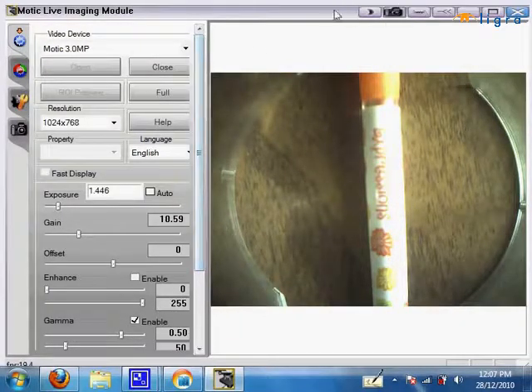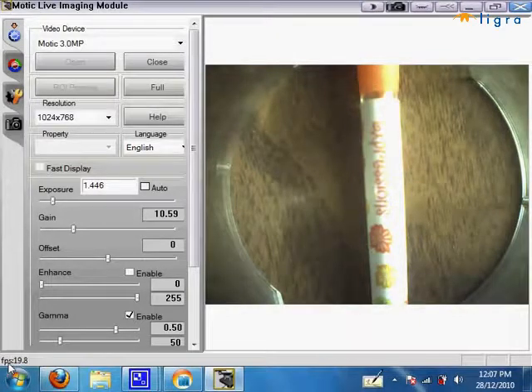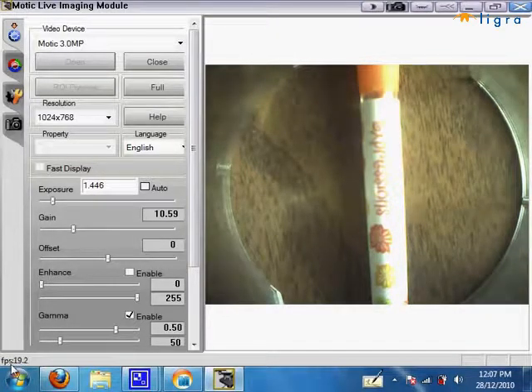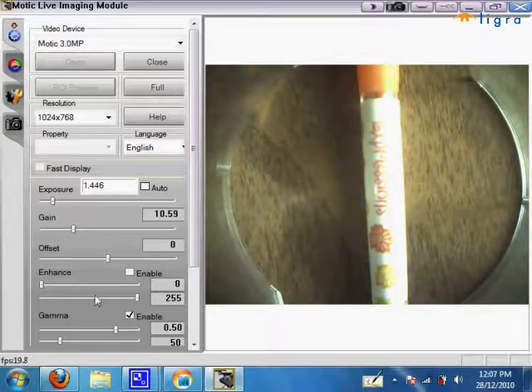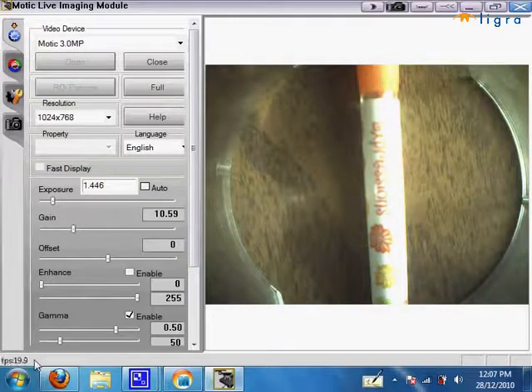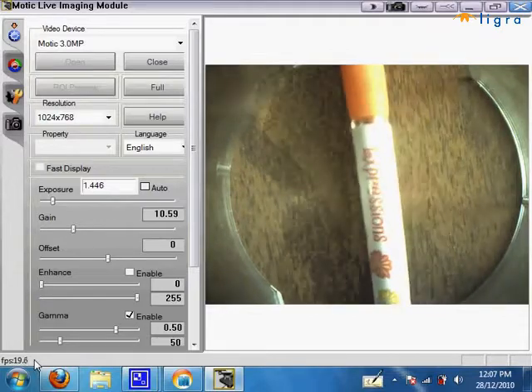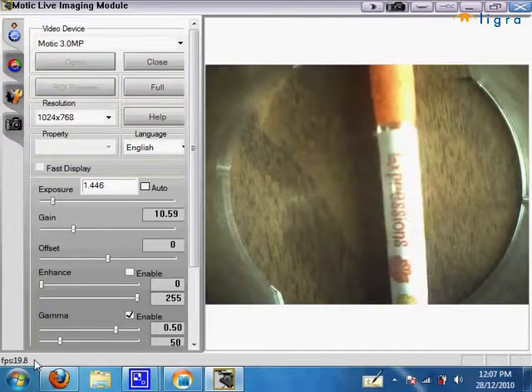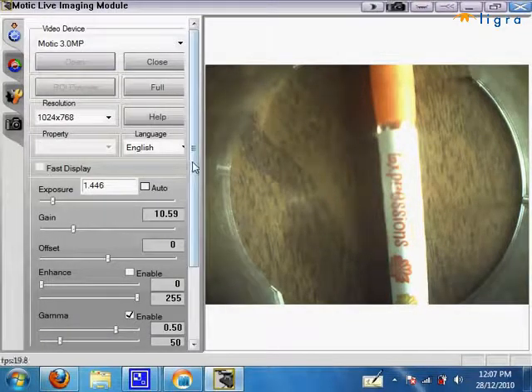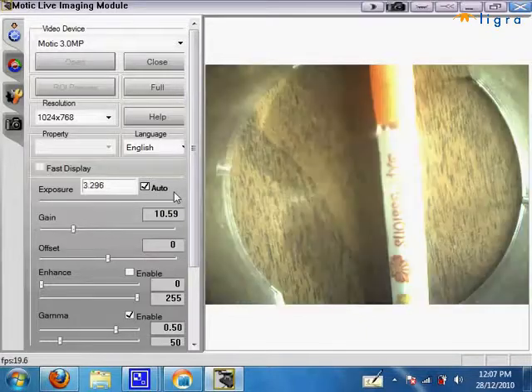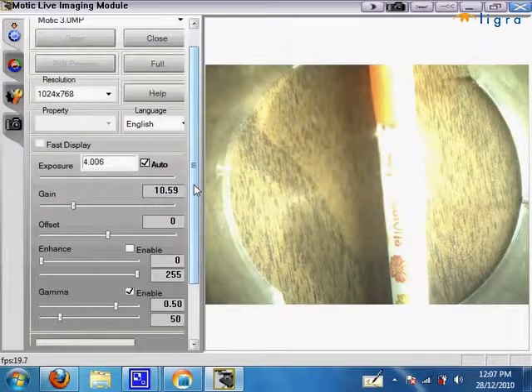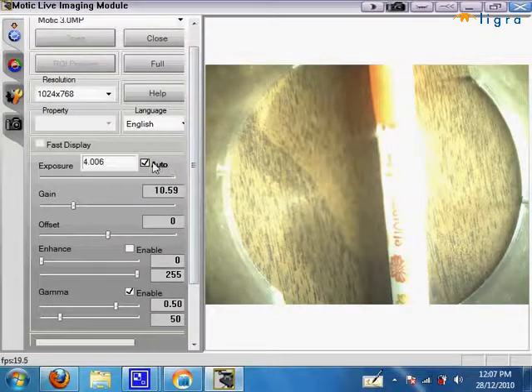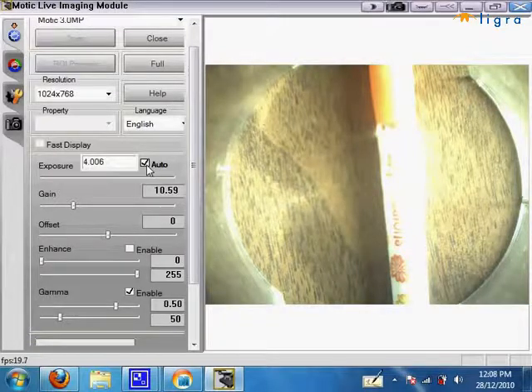Right now I'm getting a frames per second of 19 which is a very smooth video as you can see. How to get a very smooth video is first go to auto exposure. Auto exposure lets the computer decide how much exposure to use. It's the most easiest option. But if you understand what exposure is, you can manually adjust it yourself.